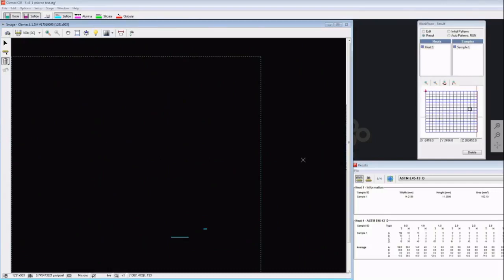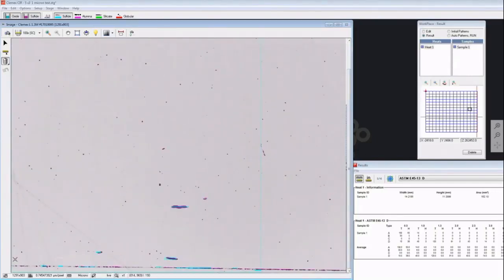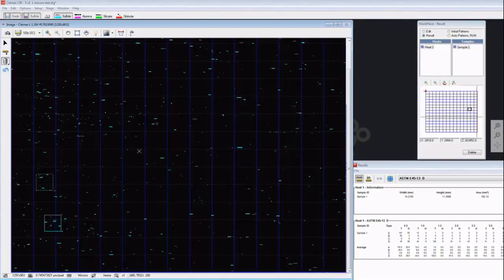So we're going to be looking at that thin inclusion here. As we can see, we have a scratch on the bottom, and it was detected as an inclusion. The reason why it was detected as an inclusion is because it was on the same orientation that we chose, horizontal. You can notice here that this one was not detected because it's not in the same orientation. So this is part of the work that an operator must do. He must clean his sample. And once it's clean, as you saw, this thin inclusion worst field floating window was here, and it moved here. So it always goes on the worst field.